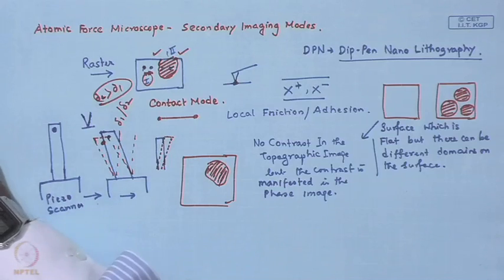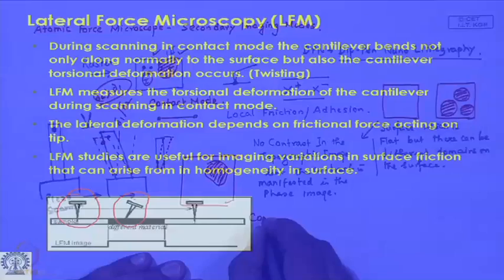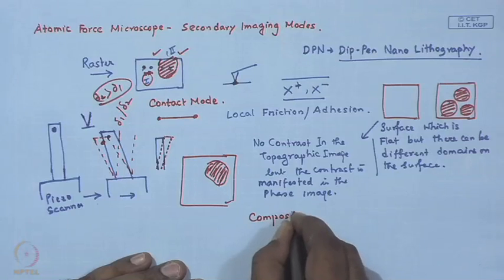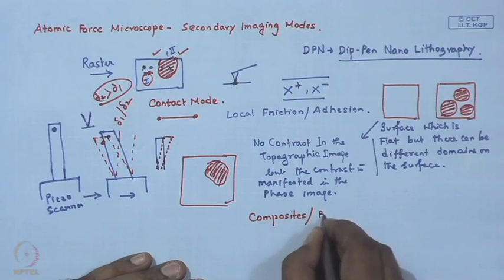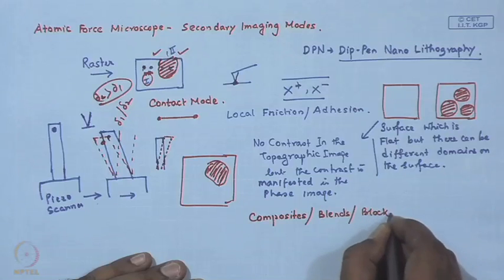So, this is all about lateral force microscopy, a very powerful tool to identify different domains, particularly useful in analyzing composites, blends and block copolymers.